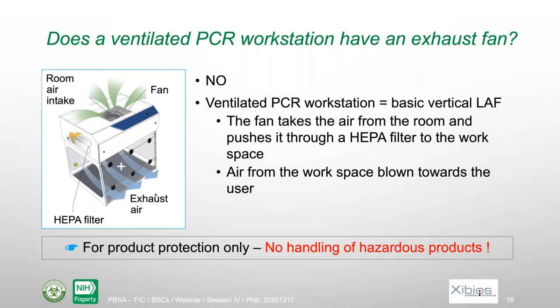It means that, for instance, if you have to extract DNA or RNA from an infectious agent, you should not do it there. You should better do it in a biosafety cabinet, or it would even be better on the bench than in this type of equipment. This equipment is used to prepare the premix before the PCR, or to handle the DNA or RNA themselves.